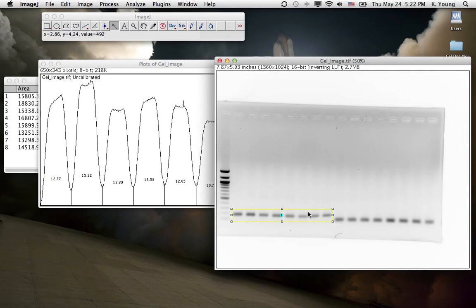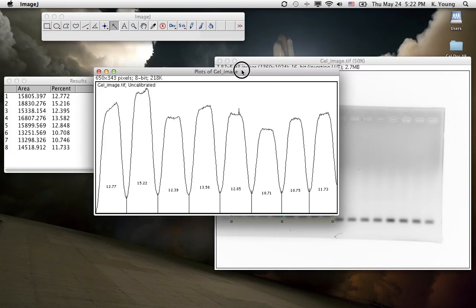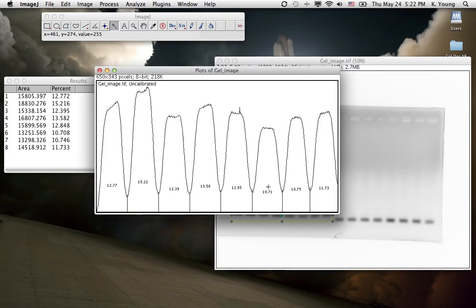And if you go back to the original gel image and you kind of look at it, you see this band here is the faintest. And it's indicative of the low value that it was assigned.